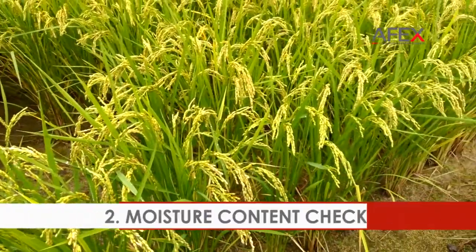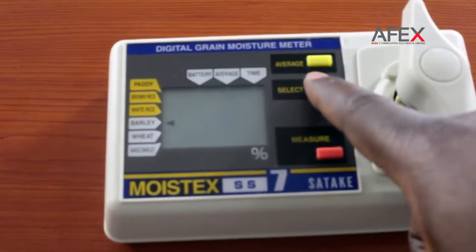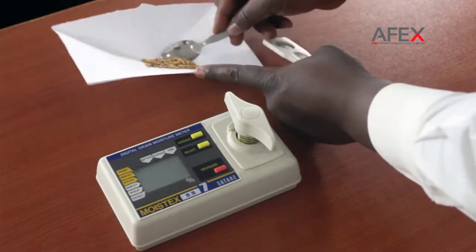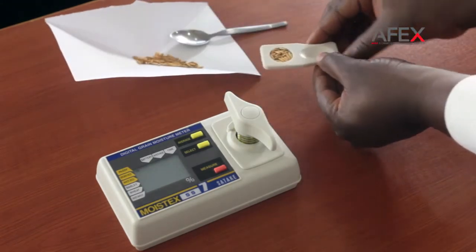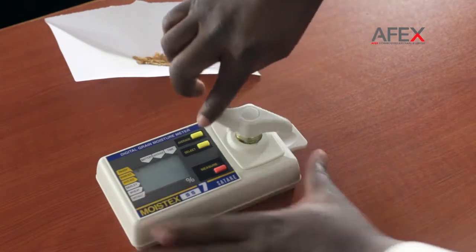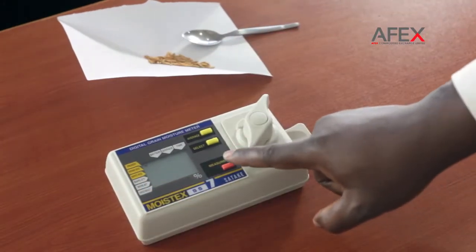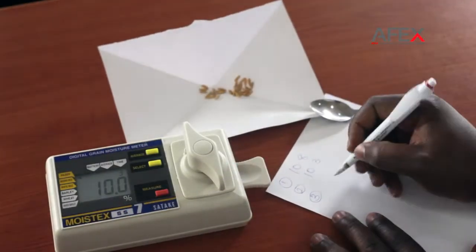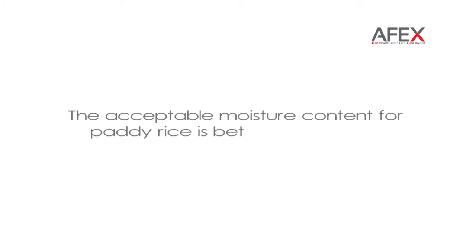Moisture content check. The handy moisture meter is effective for this stage. Set the mode of your meter to paddy. Fill the sieve-like dip in the meter tray with paddy. Insert into the meter. Hold in place by turning the lever and take your measurements. Repeat 3 times and find your average. The acceptable moisture content for paddy rice is between 12% to 14%.